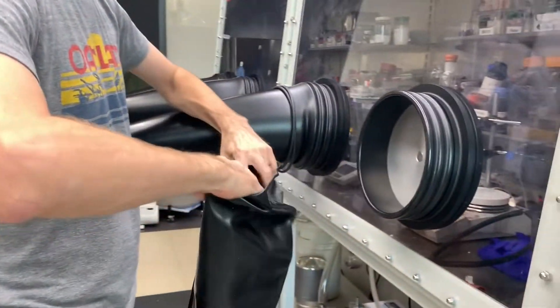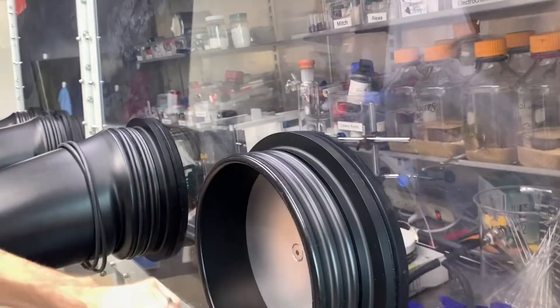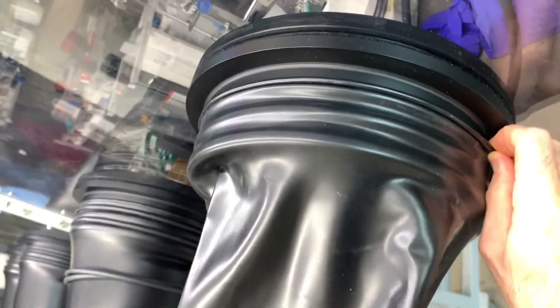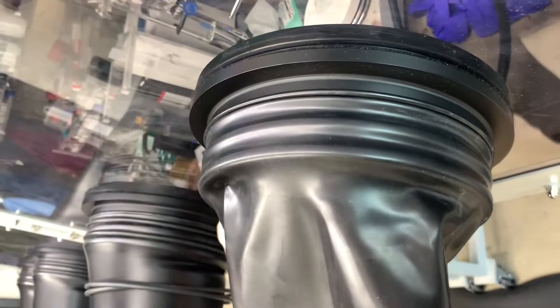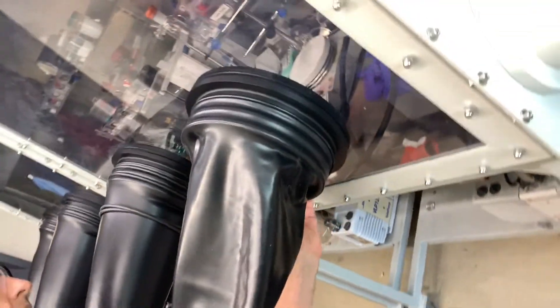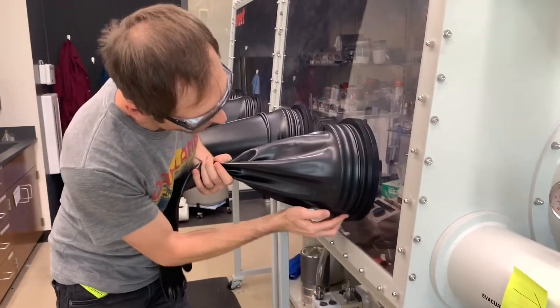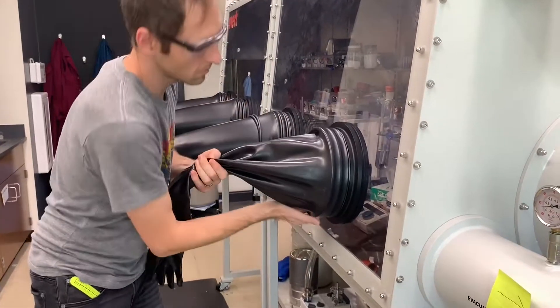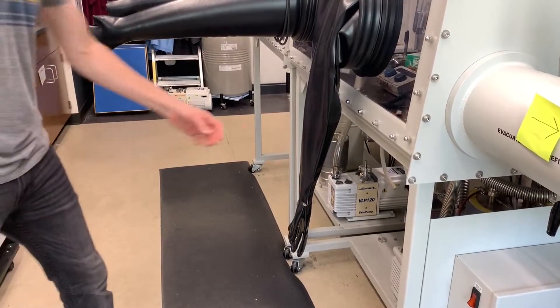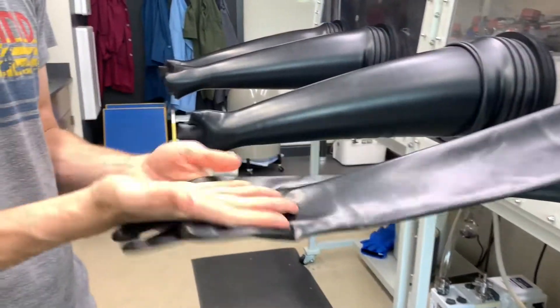Once you've got the glove you need, it's time to put it on the port and get back to business. Stretch the cuff of the glove over the port, and make sure the lip sits firmly in the small ridge that's closest to the window. Before going any further, it's worth checking that you put the glove on in the right direction. Think about how you want your hand positioned, and make sure the glove is rotated to match. You'll be pretty bummed if you realize it's on upside down or backwards.